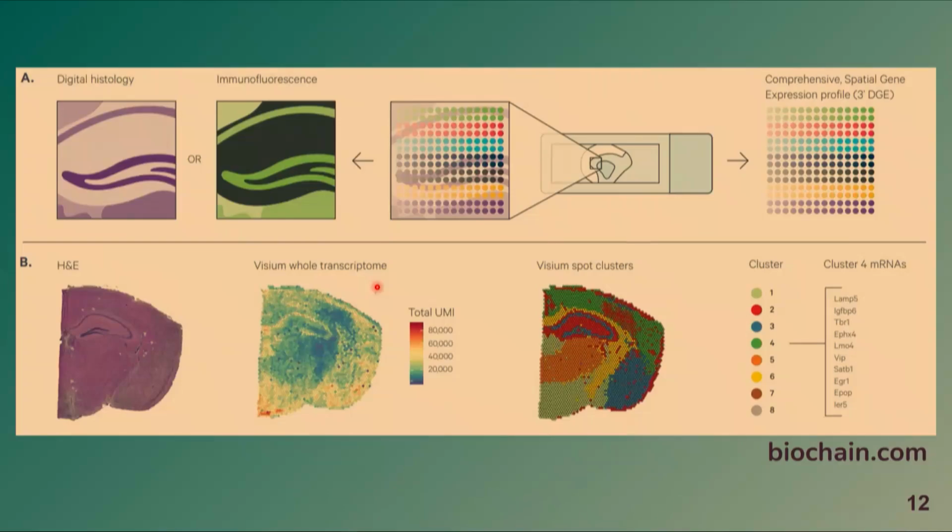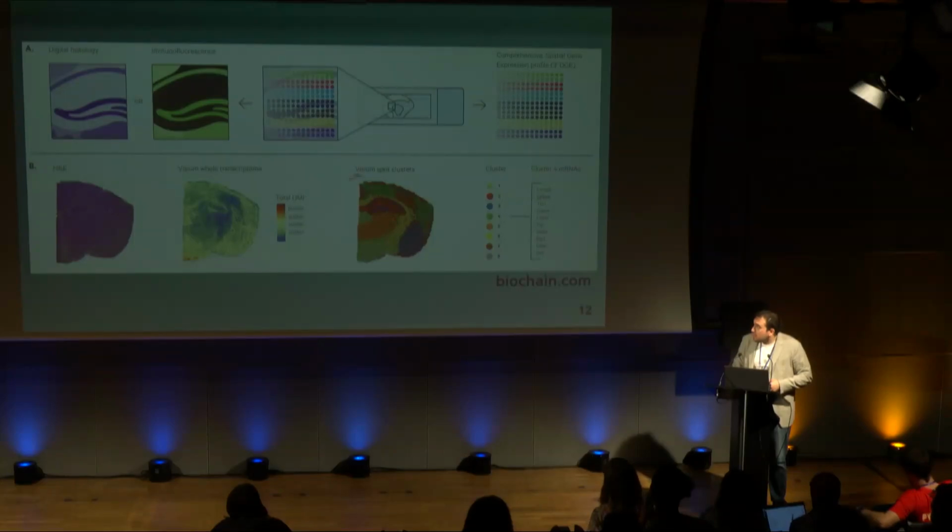With this information of gene counts and gene expression, we can cluster the spots, initially only using gene expression data, not exactly spatial locations, despite recent works having tried to aggregate spatial information to perform clustering, and thus we can get this nice structure.